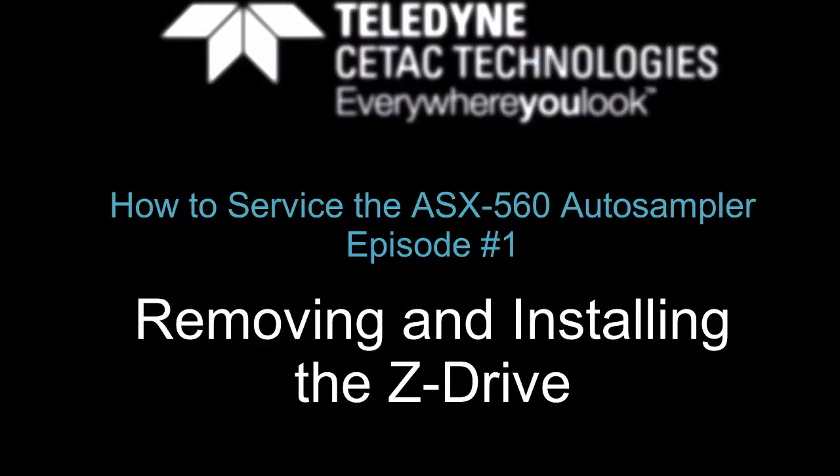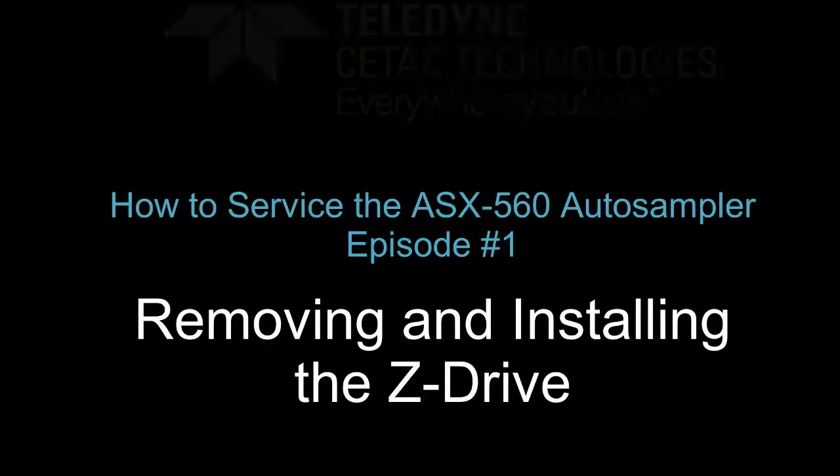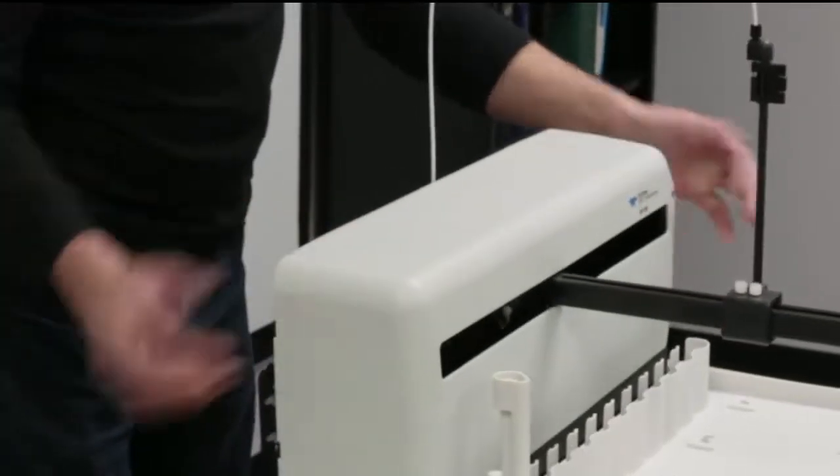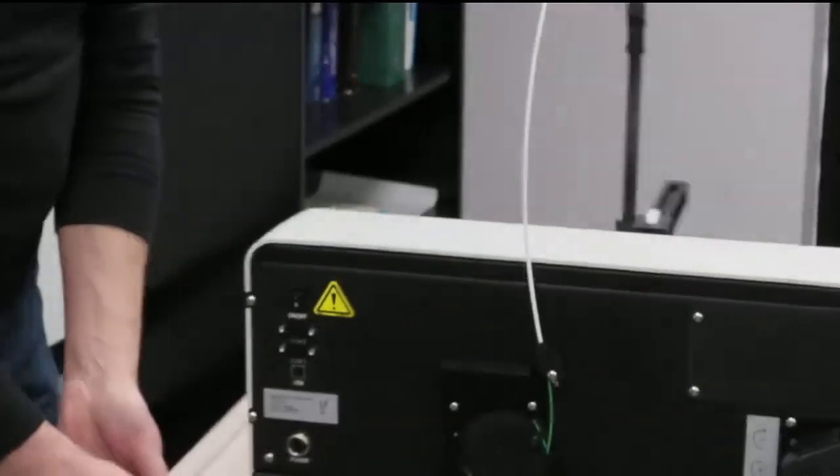Welcome to the first video on how to service the ASX 560 auto sampler. A common task is to replace the Z drive. First, make sure the power is turned off.